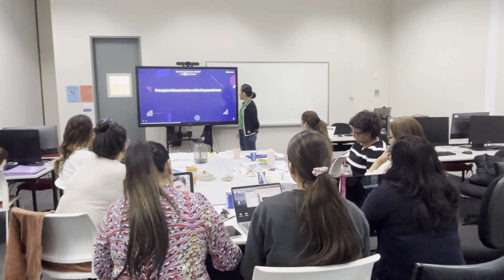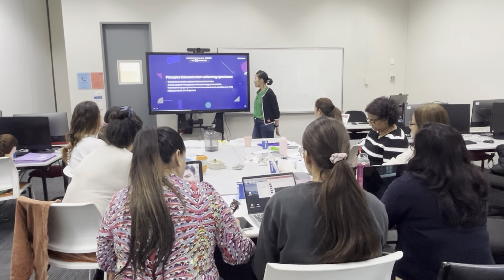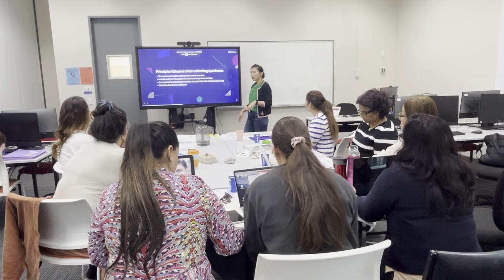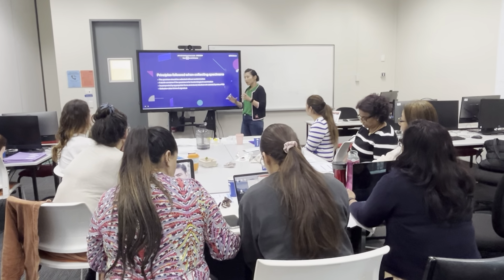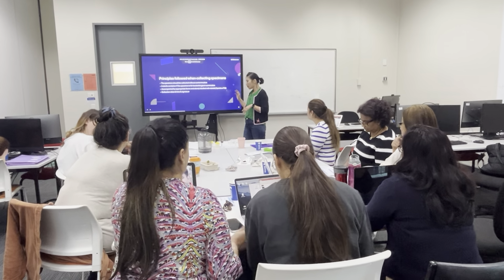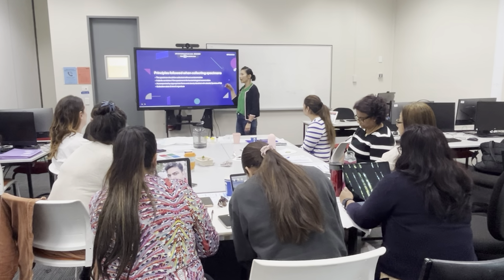So the principles we follow for specimen collection: the specimen should be collected without contamination, especially if you're collecting for bacterial examinations. It needs to be accompanied by the appropriate form, which is the referral given by a doctor. The form needs to have the right type of specimen, which we're going to teach you about, and also the right information of the patient. So when you are collecting, say, a patient drops off the specimen for his wife.